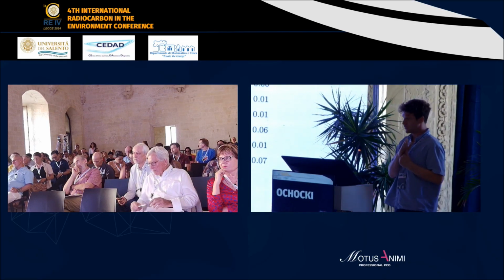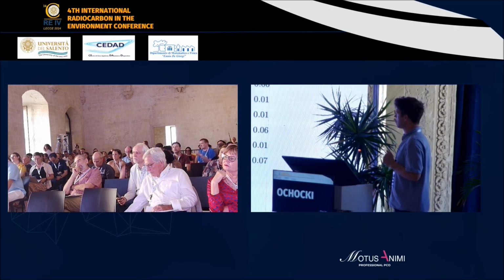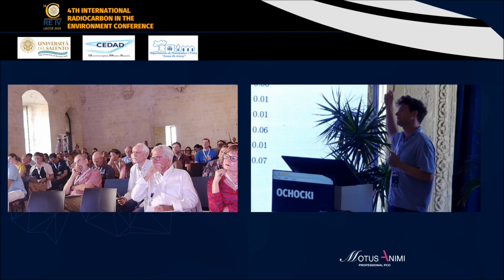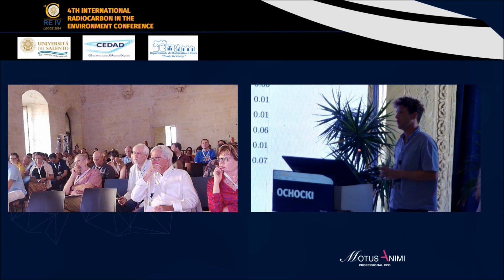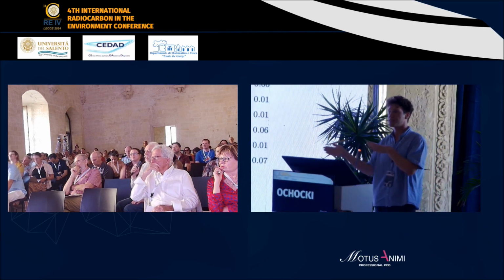So we don't do the 400 step. We step combust the material at 630 degrees, and then effectively the last step we do by the routine combustion at 900 or 1,000 degrees. So you do 2 temperatures, therefore. 2 temperatures. I see. Okay, gotcha.